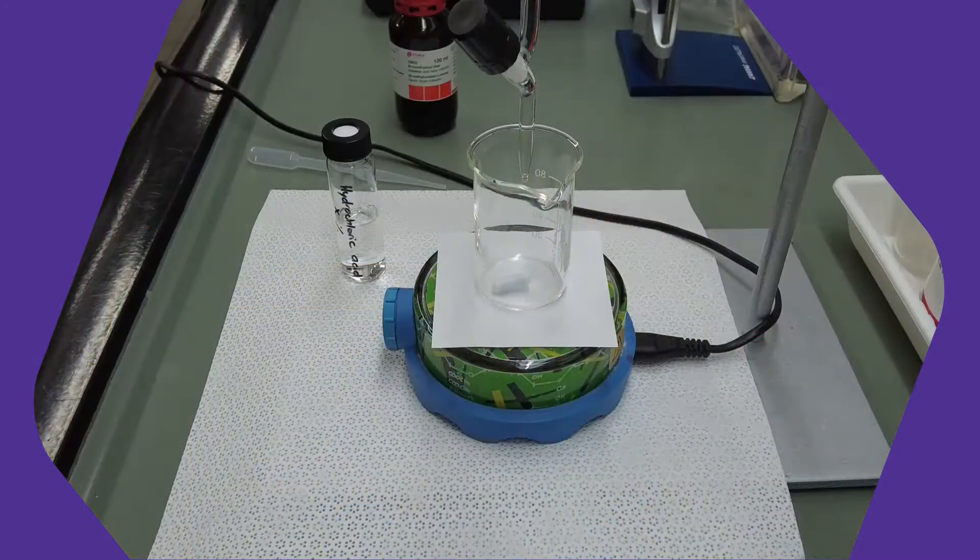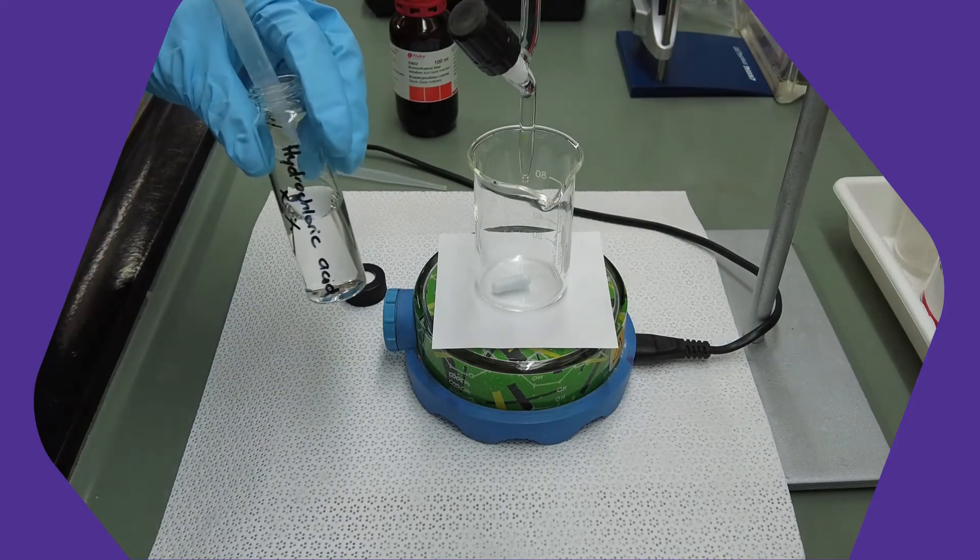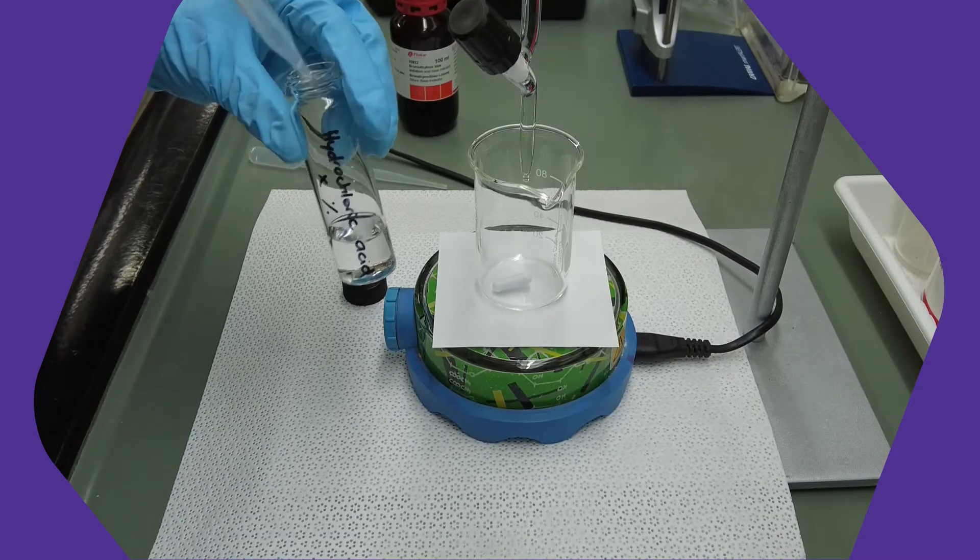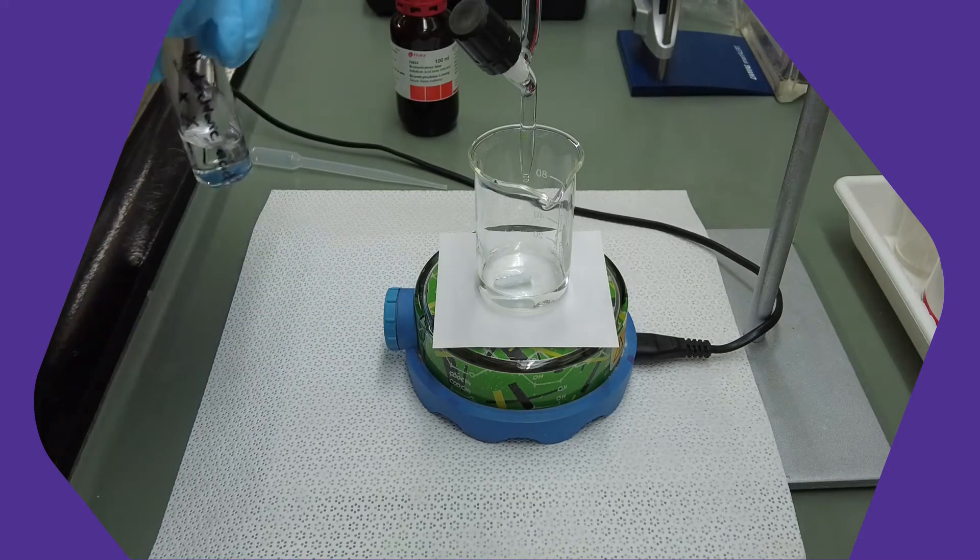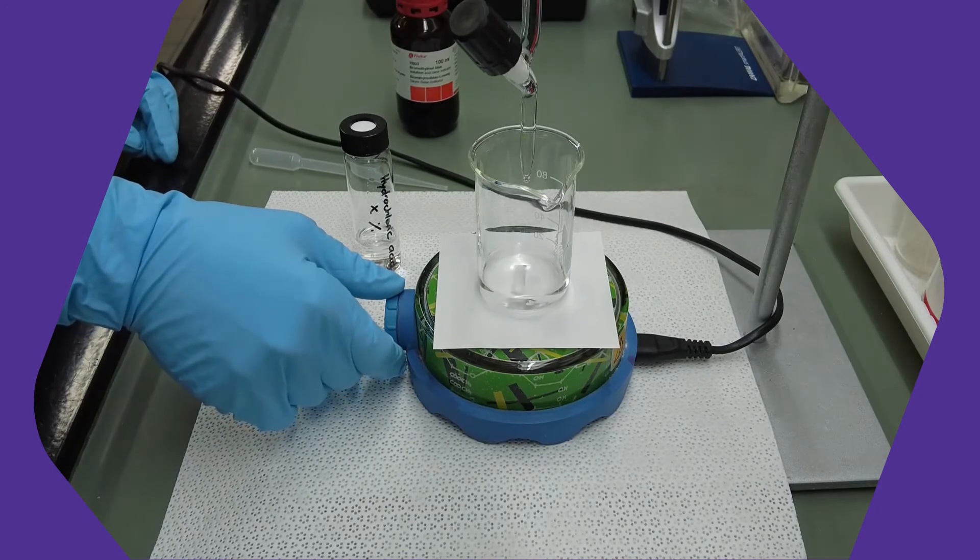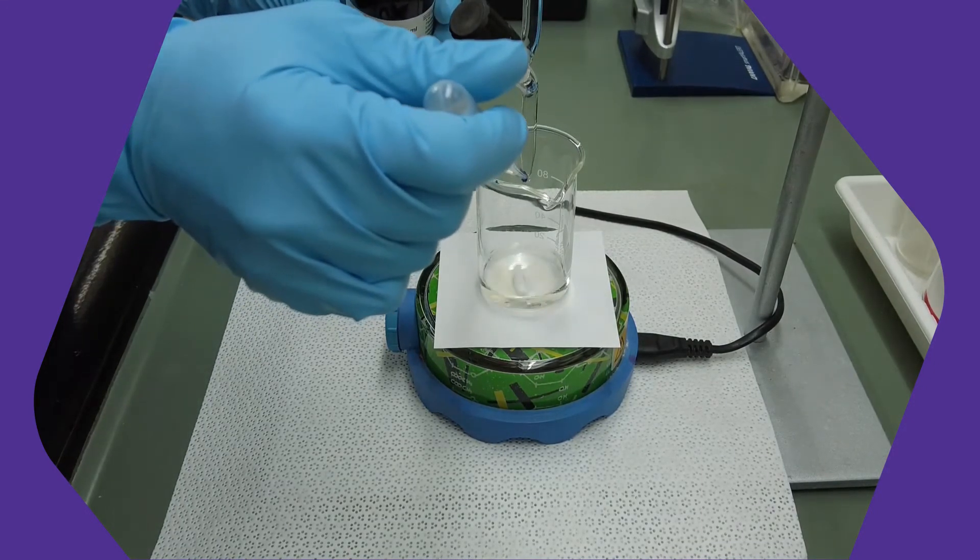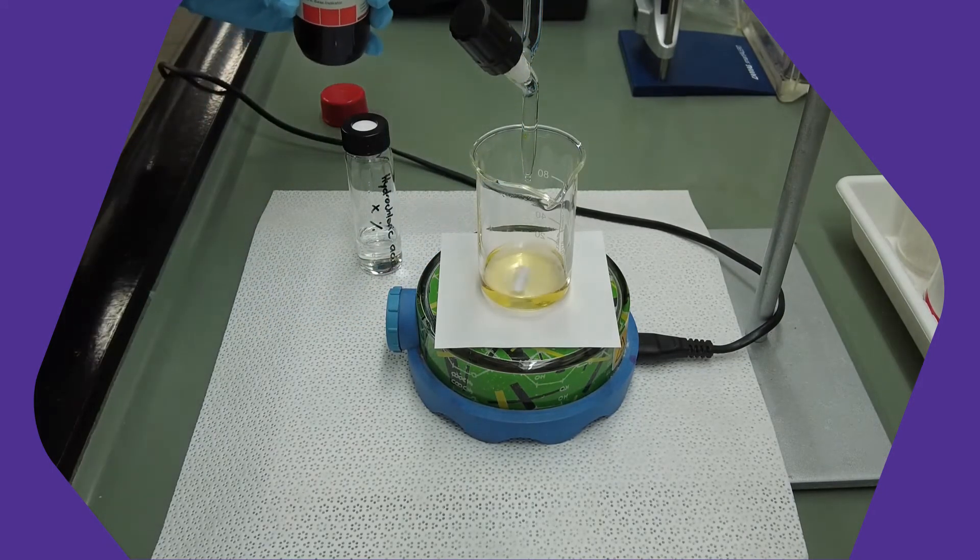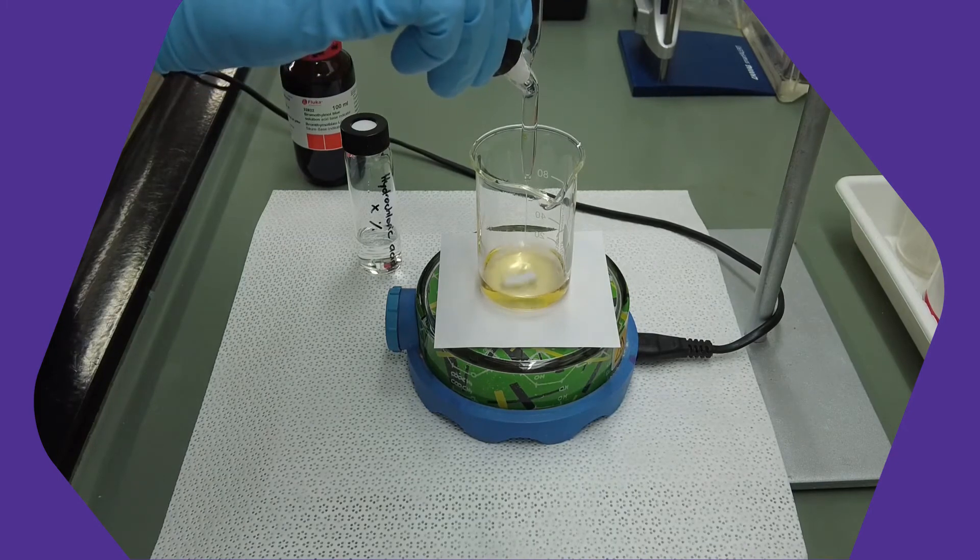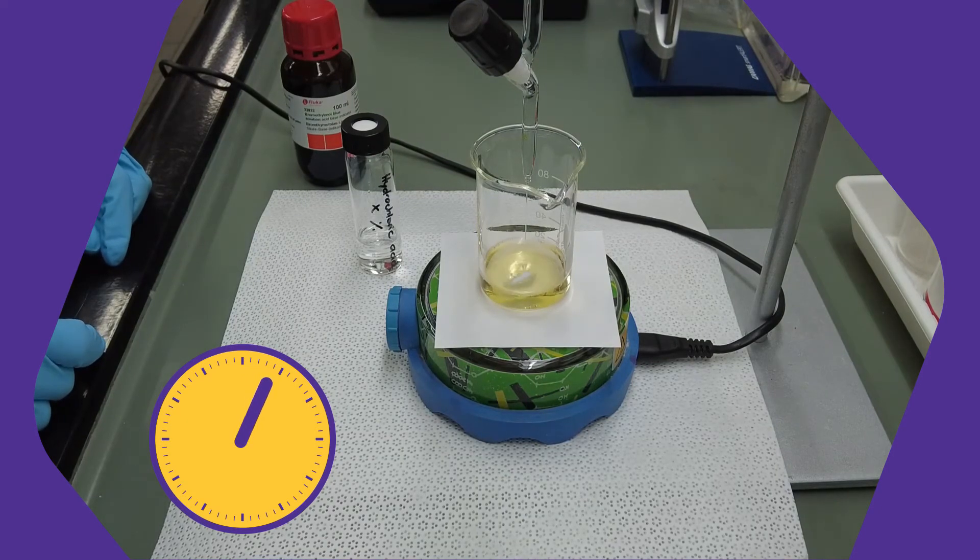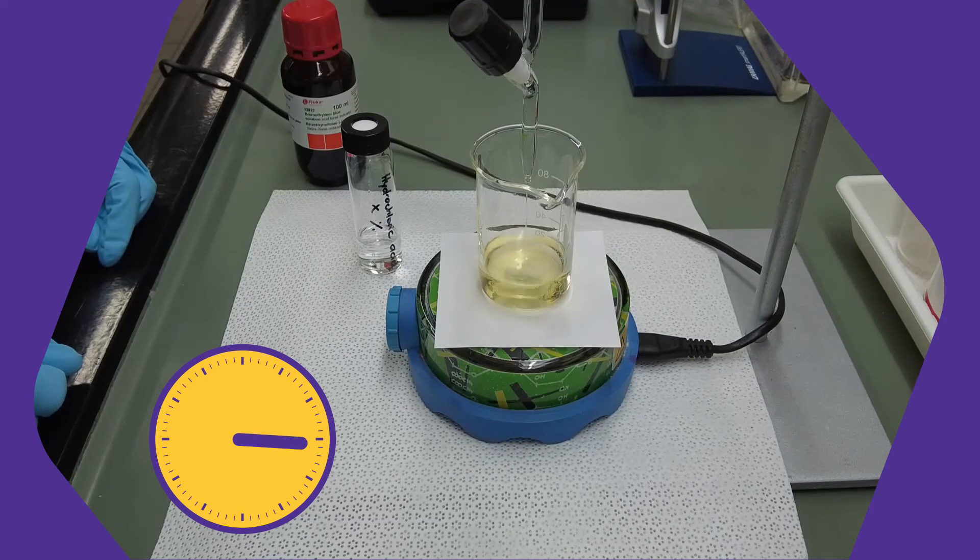I prepared a quick example for you. We now put exactly 10 milliliters of hydrochloric acid with an unknown concentration into a beaker. We also add a few drops of indicator solution. The concentration of hydrochloric acid can be determined by titrating it with sodium hydroxide solution with a known concentration. In our example, it has a concentration of 10%. The sodium hydroxide solution is already in the burette.